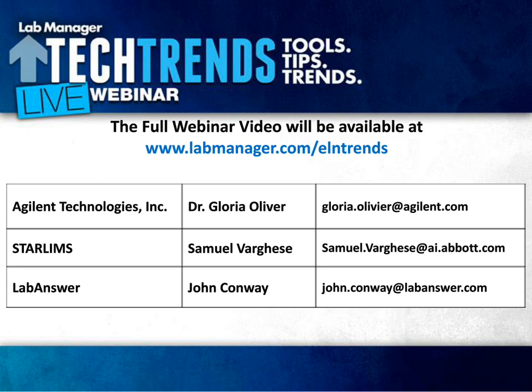Great, thank you. Now, how frequently should a lab be reviewing their informatics solutions? What would be your recommendation? John, maybe I'll start you with that. That's a great question. Continually. I think you've got to align your internal objectives. For instance, right now, big data has gotten a lot of press, right? And the problem is a lot of customers weren't ready to make big data and the analytics work with all the data repositories and solutions and applications that they have. So trying to continually stay ahead of the curve or stay ahead of the trends is a huge challenge, especially around the budgetary constraints. But I think that organizations need to really stay on top of what they're doing and how they're doing it to maximize their efficiencies and their future analytical capabilities.